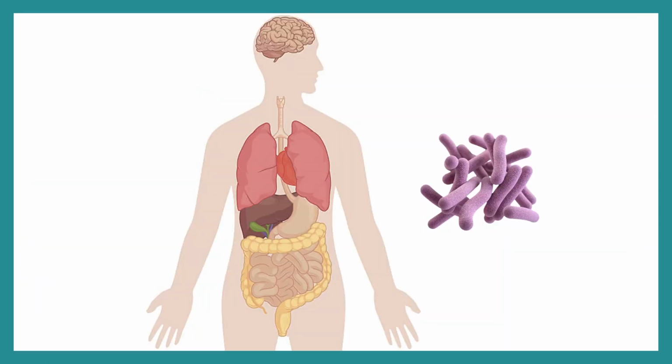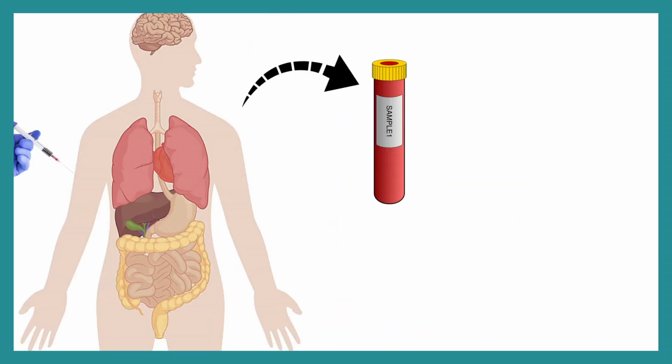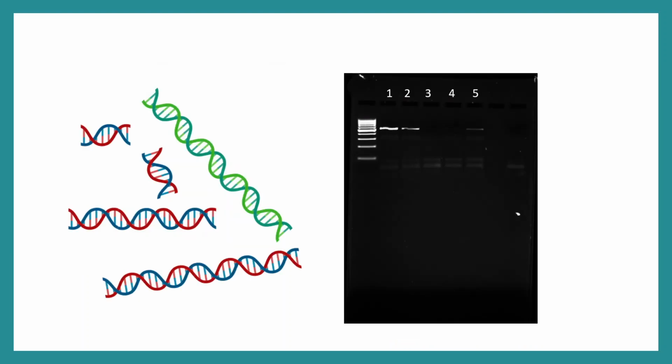So let me give you a quick idea how PCR can be used in medical diagnosis. Let's say you are affected by a bacteria. Now from your sample, one can look for a particular gene which is very specific to that bacteria. I'm only giving you an overview. And if that particular bacteria is present, you might get that bacteria specific DNA in your sample. In this case, this green DNA or green amplicon is that bacteria specific amplicon.